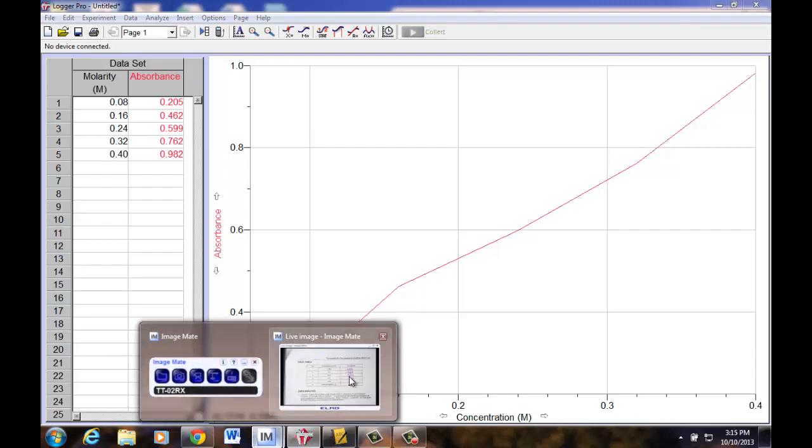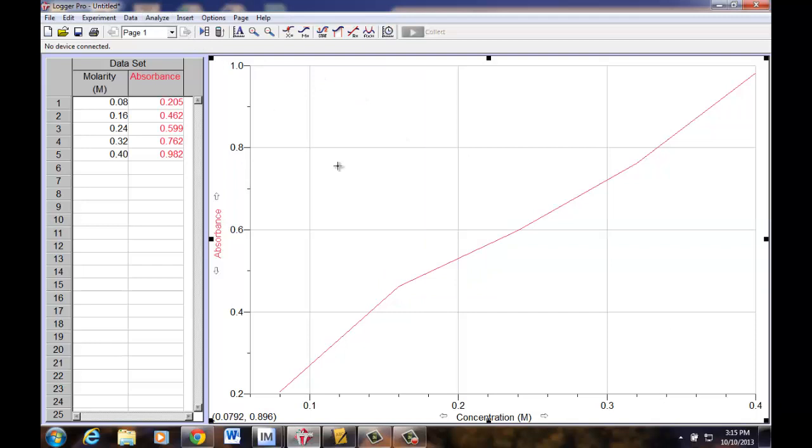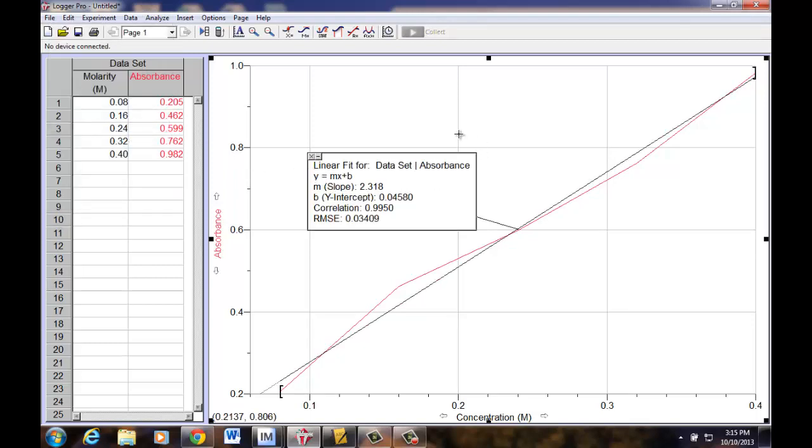So thinking about what we're being asked to do back to this particular slide in Analysis 1, we're being asked to put those numbers into the LoggerPro program and then select Analyze Linear Fit for your graph. We want to know what those numbers are for the best straight line and write them onto this report. So at this time, we'll go up to Analyze Linear Fit. Notice how I get a text box that appears. The text box is a Y equals MX plus B format, and that's the best straight line. So really what it's done for me is automatically created that line for us.